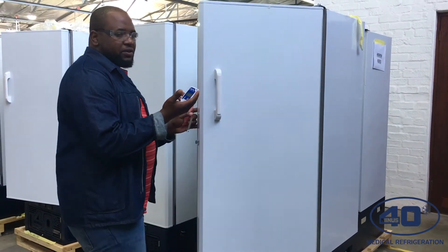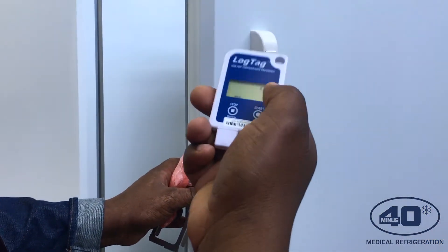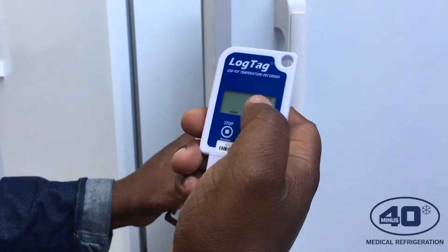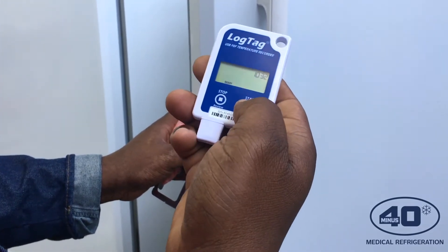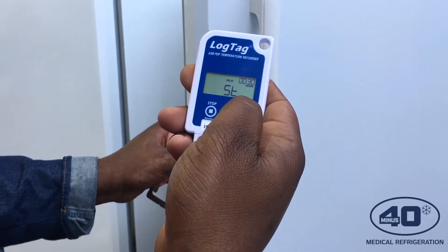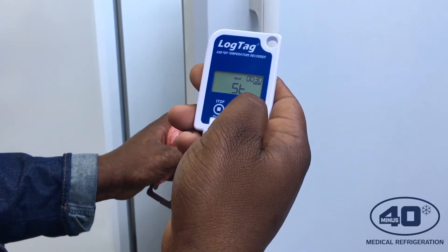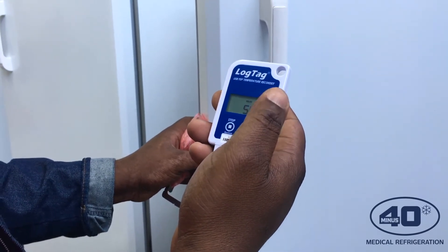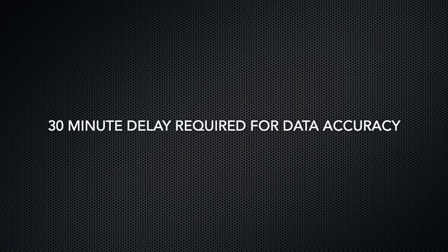When you look at the display, you have to ensure there is correct timing and that 'Ready' is showing at the bottom on the left-hand side — that means the LogTek is ready to be used. The next thing you do is click the Start key: press and hold, and you'll see there is a delay of 30 minutes. This delay ensures the first reading is not an error, because the LogTek needs time to read correct readings.